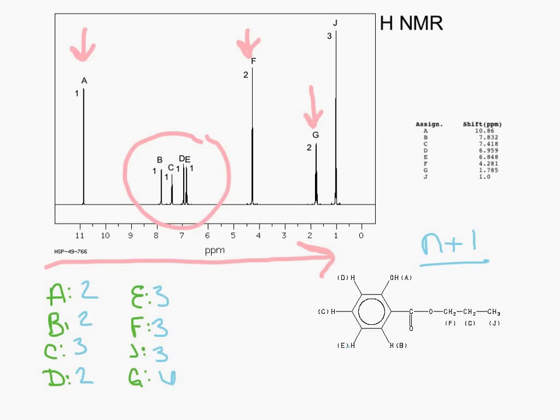That is all the information that you can obtain from a proton NMR and what it means.